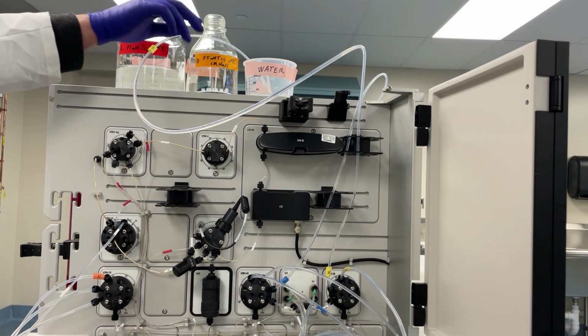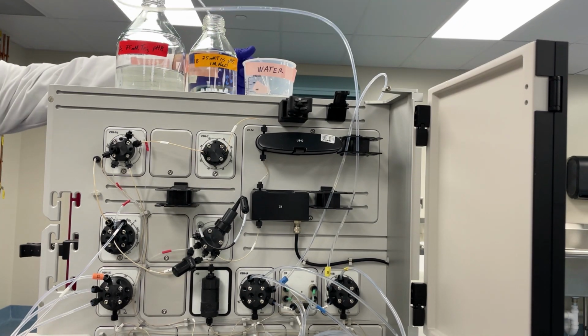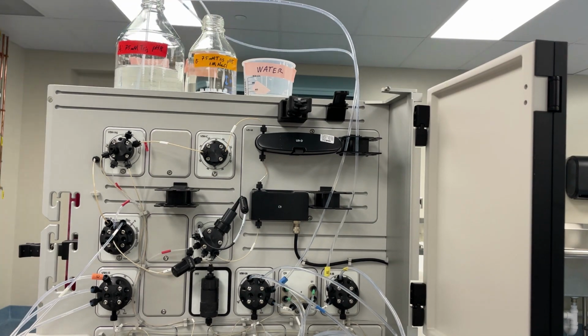We need to put our inlet lines in their buffers. We'll put B1 in a high salt buffer and A1 in a low salt buffer. These are at pH 8.